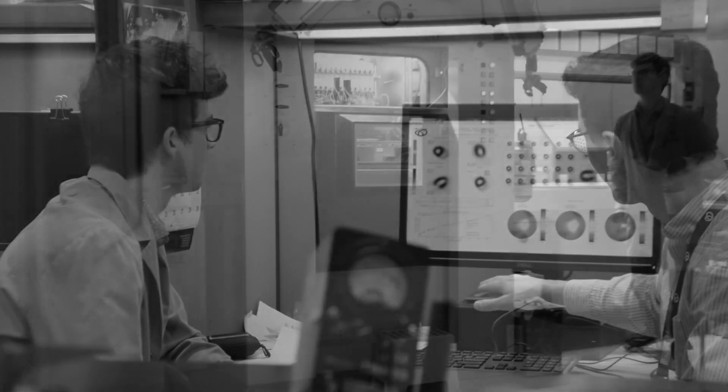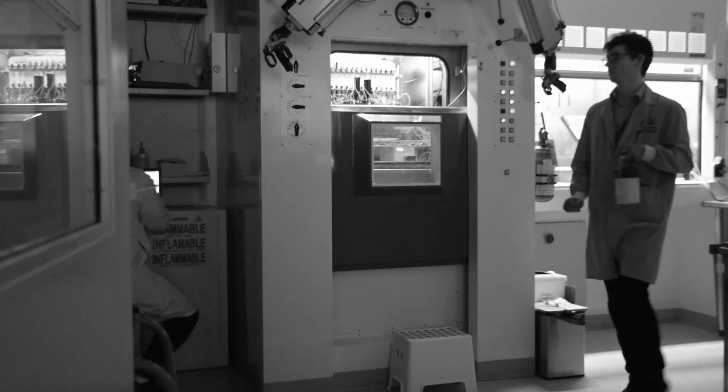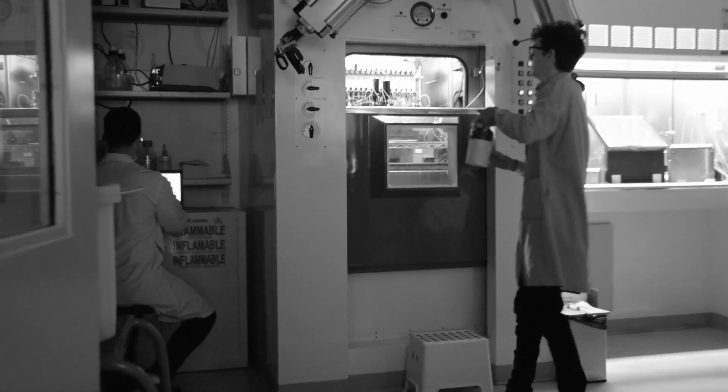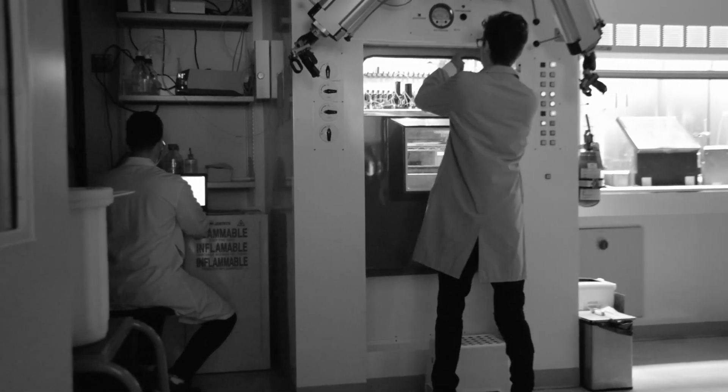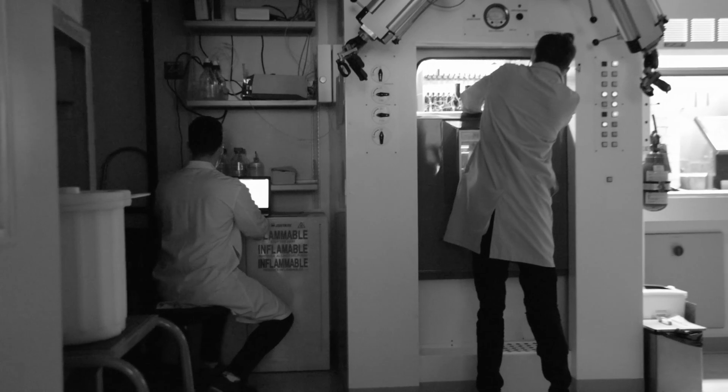The lab also provides a unique platform for education to students just entering the field of molecular imaging research.